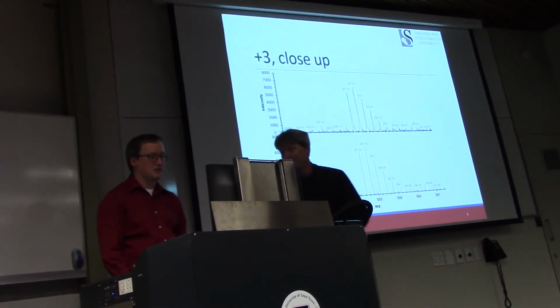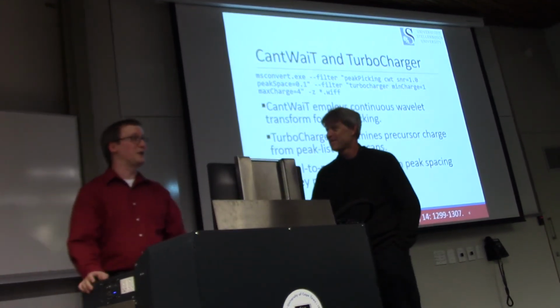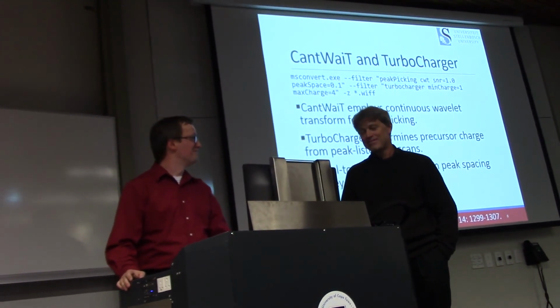Well, I can already tell you the answer to that one. As a relatively cynical bioinformaticist, when you increase sensitivity by twofold, you double the number of peptides you see for serum albumin. Got you covered.